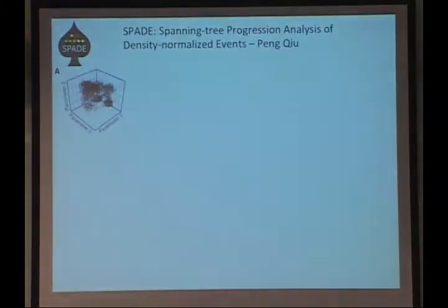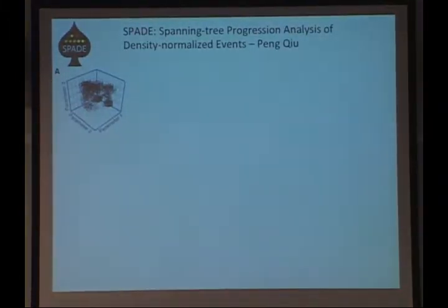And so that was what led us to create or apply SPADE, or led Aaron, I should say. And the basic idea is that here in 3-dimensional space, again, Aaron's going to explain this in more detail, but if we have in 3-dimensional space this distribution of a complex population, you can see certain areas that are dense, certain areas that are sparse. The first thing it does is it removes all the dense areas so that everything's evenly distributed.